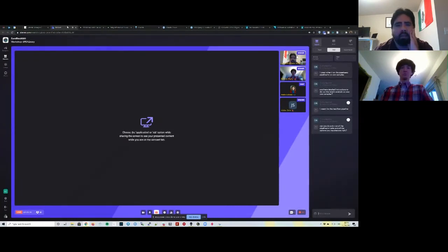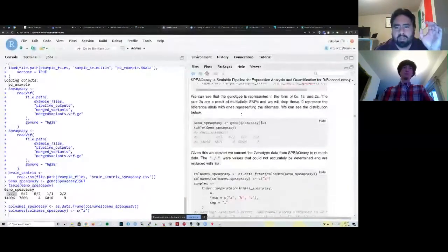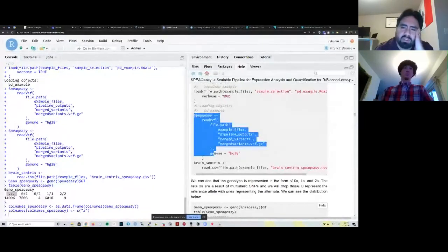So Devika qualified the question, which was, are there detailed instructions to do the variant analysis in your own sample? I mean, when I run the speakeasy pipeline from my own samples. Yeah, so if you run speakeasy on your own samples and you don't have DNA genotyping data, what you'll be able to get is this VCF file alone, the merge variants.vcf file. Now, what can you do with it, if you only have the RNA inferred genotyping information?